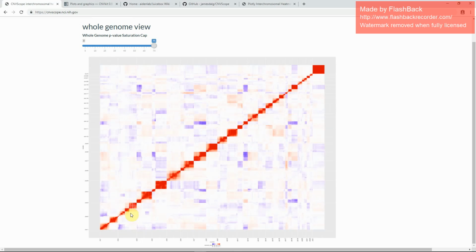This is chromosome 2 that does not. This makes sense, as the P and Q arms often behave independently in copy number data. Reduction in the immediate off-diagonal signal between the largest blocks, between this block and this block right here, corresponds to the position of centromeres, as frequent rearrangements at centromeres result in reduced off-diagonal correlation near the centromere.